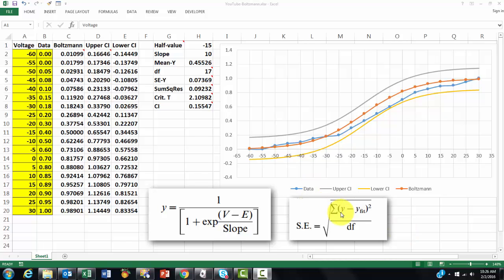When you are dealing with sigmoidal or S-shaped curves, like this one, for instance with EC50 determination or IC50 determination, then one of the best formulas or equations is the Boltzmann equation.